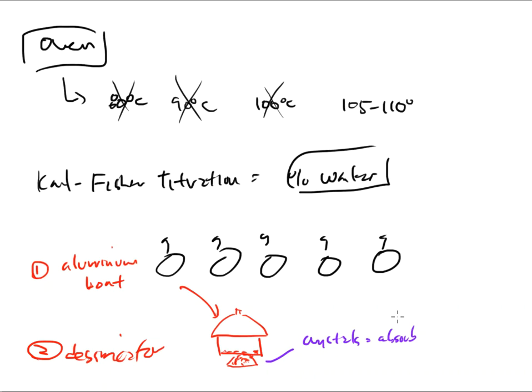And of course, weight and mass are different, but we use weight and mass interchangeably as a term in a laboratory. We shouldn't be doing it, but we do. That's just the way it is.